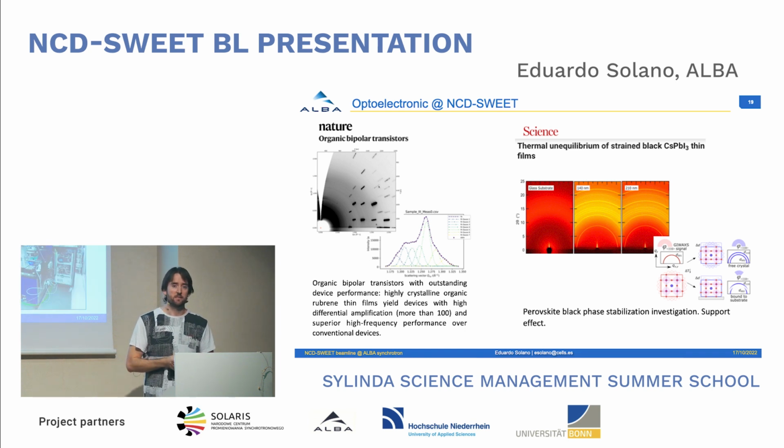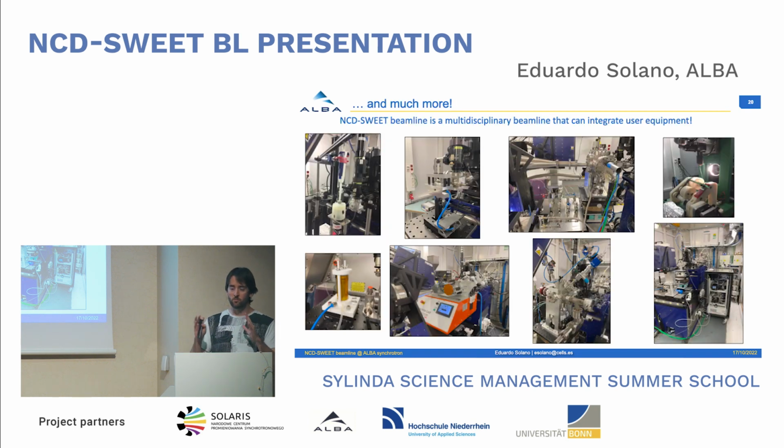But we are doing more things at the beamline. So this is the take-home message. We can do almost whatever you want to do. And to be honest, I never believed that we could do so many things when I started in this field. Because here you can see the spin coaters that we have in the lab, we can do it in situ, spin coating in situ. Here is to measure the conductivity in situ. So you can see the conductivity changing while you are changing the scattering pattern. Here is for catalysis. Sample exposed to different gases at different temperatures and see how it's changing.